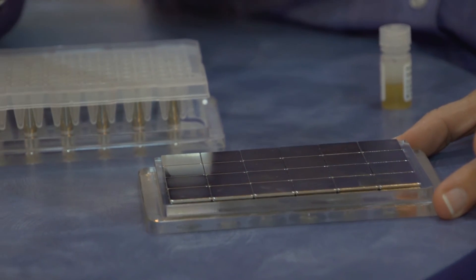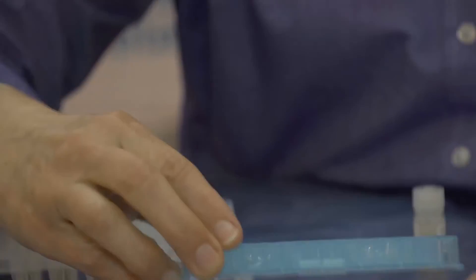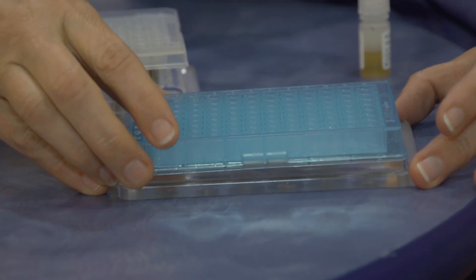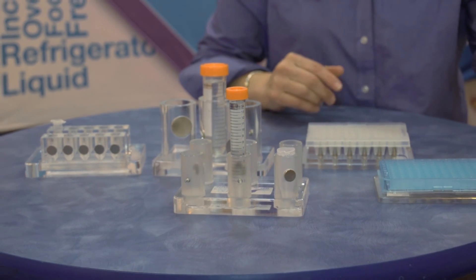The standard microplate rack has 24 flat-shaped magnets aligned on the top surface of the rack. There's a lip formed by the magnets which helps stabilize the microplate. Flat bottom microplates with any number of wells will allow the beads to collect on the bottom of the wells, making the addition or decanting of liquids much easier.